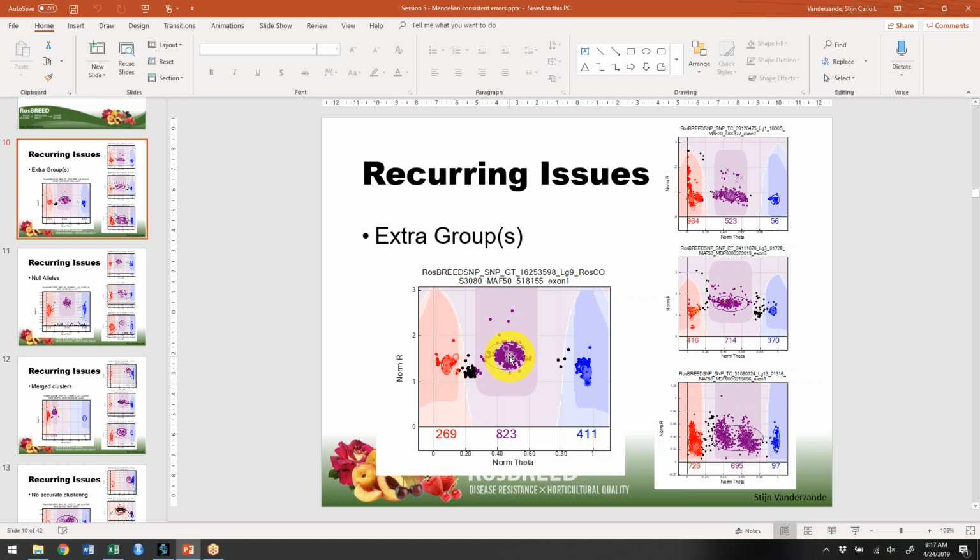That would mean that following normal segregation patterns, I would expect 25% of the offspring to be AA, 25% of the offspring to be BB, and 50% of the offspring to be AB. And then I just have to see what the other individuals do. So hopefully I'll see some individuals in here, which are the BB. And then I might probably see some individuals in here as AB. And then maybe I'll only see individuals in this cluster, and maybe that's about 25% of the offspring. And I won't see anything in this cluster. Well, if that would be the case, then this would be AA individuals.